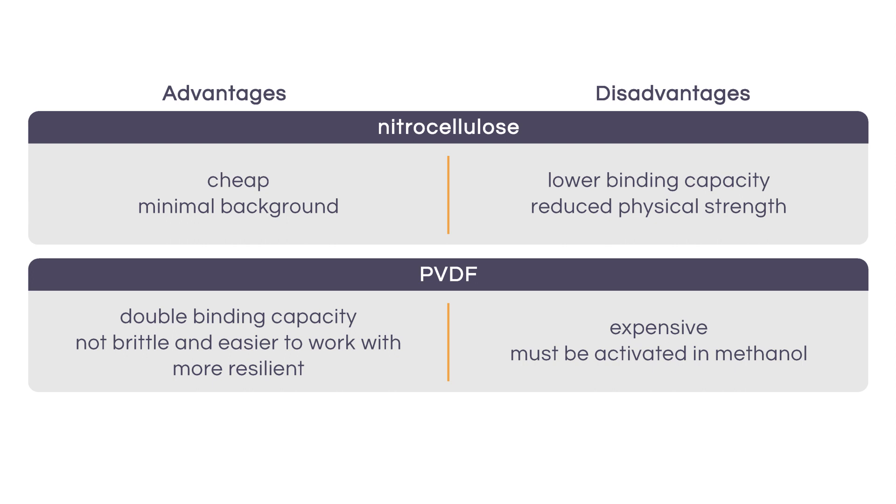Keep in mind that PVDF must first be activated in methanol prior to use. PVDF is not brittle like nitrocellulose, so it can be easier to work with.